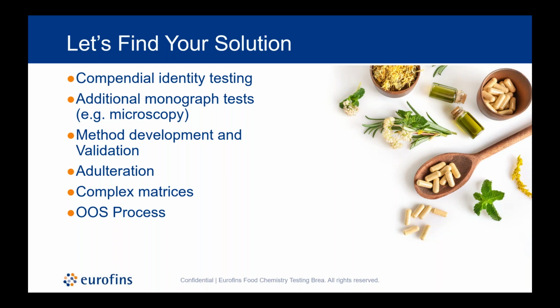Yeah, that one comes up pretty regularly, where it's not always realistic to have every possible detail about a material, and we understand that. And we always want to do our best from the first step of engaging with testing a material and providing whatever expertise we can to support providing an accurate test. And so if the information is not fully complete, we might be able to infer some information even from a common name.